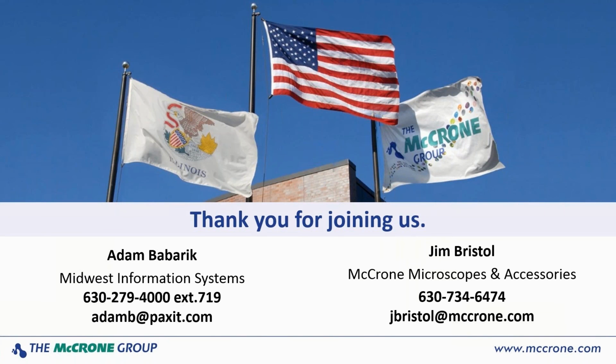If there are any questions in these situations, please get a hold of us. We'll be happy to go over those parameters with you and work with you to get the best possible setup for your application. Yeah, we have Adam and Jim's contact information up here for that purpose.